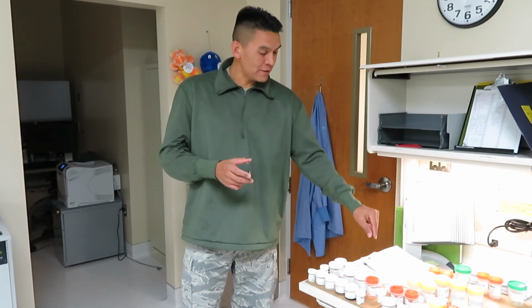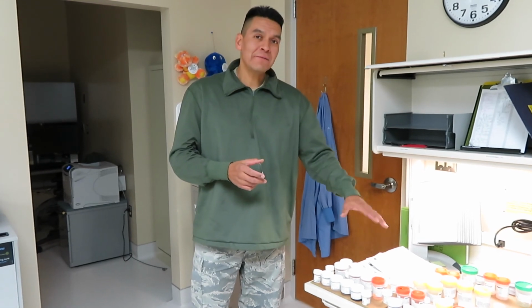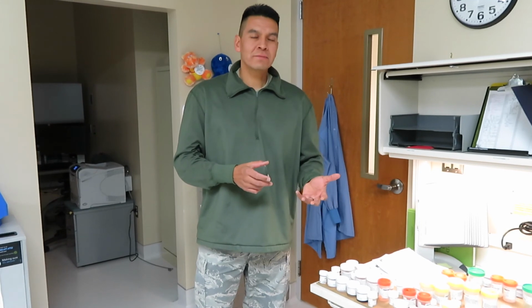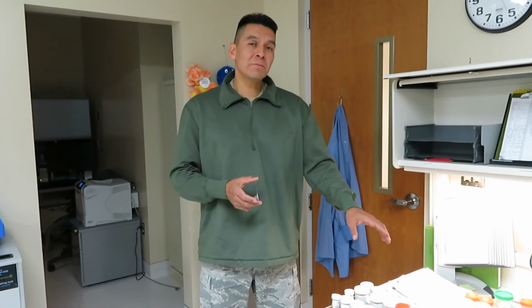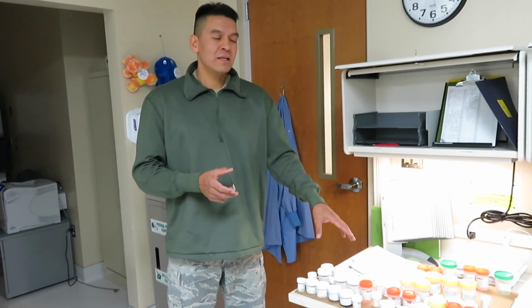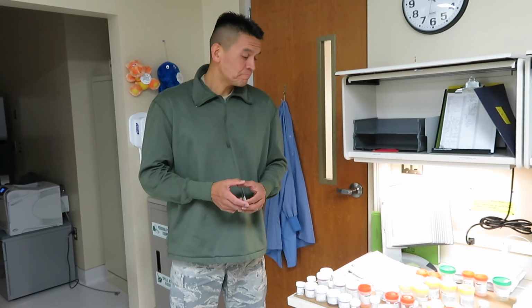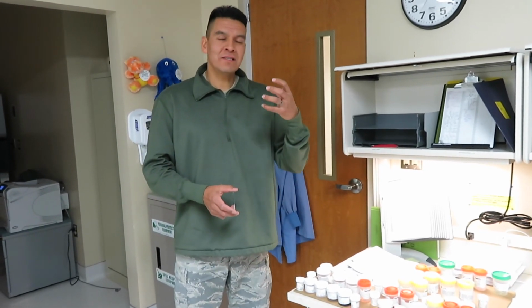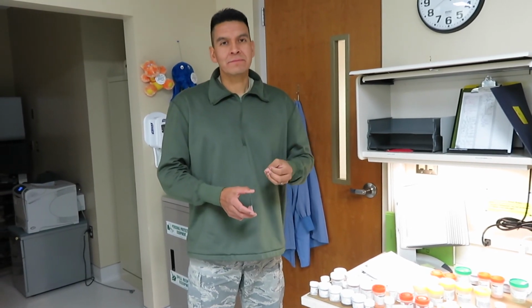the doctors put in the biopsy sample and then they fill it with formalin. If it's a gynecologic tissue, sometimes they'll use a different fixative solution. The most common fixative solution is 10% buffered formalin. And so that's what each of these containers have. And what that does is it just helps fix the tissue and the cells so they don't break down, so they don't get necrotic or die.